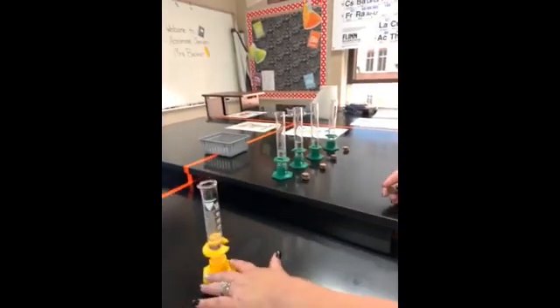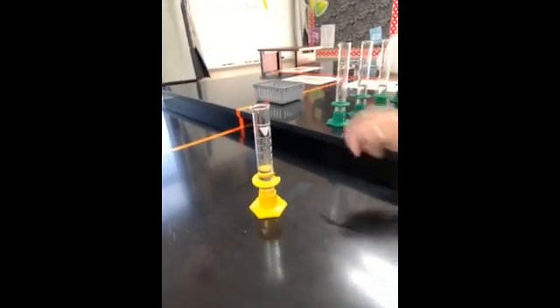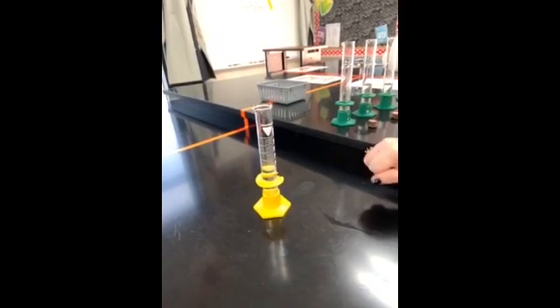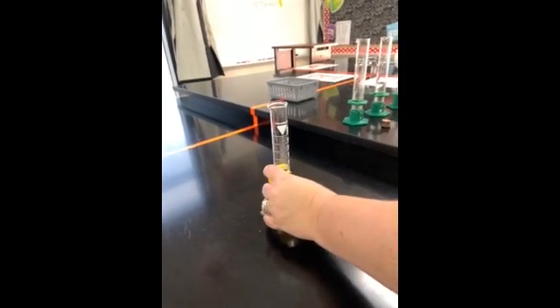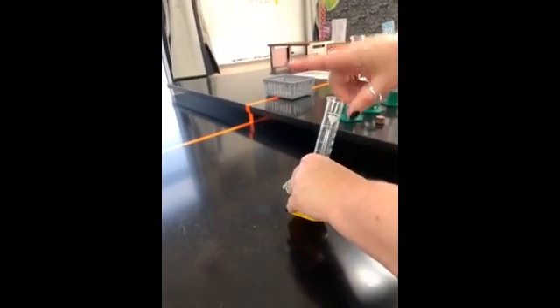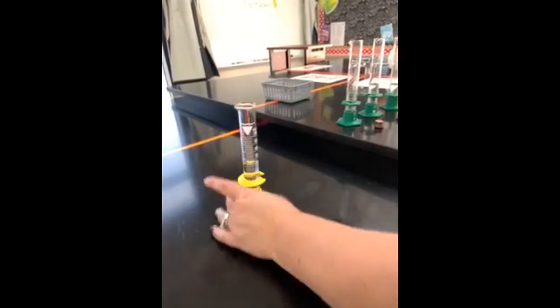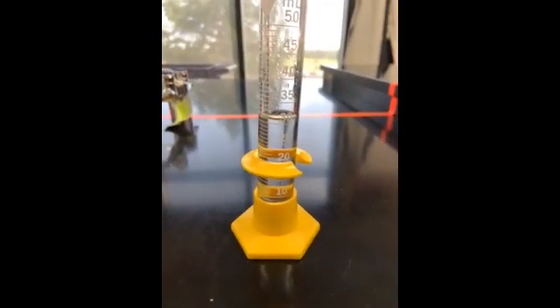Trial 4. Pre-82 pennies, trial 4, water only, looks like 24.1, just above that line, so 24.1. Now I'm going to add the pennies. I got a little bit of splatter there because I didn't tip it quite well enough, so we did lose a little bit of volume. So that's something to make a note of for the error analysis.